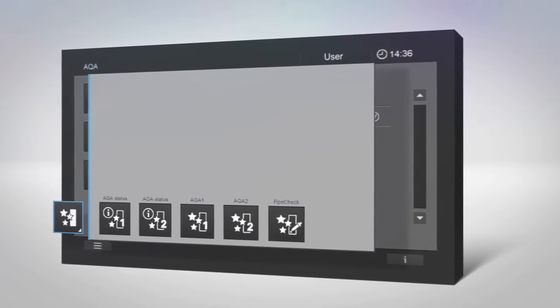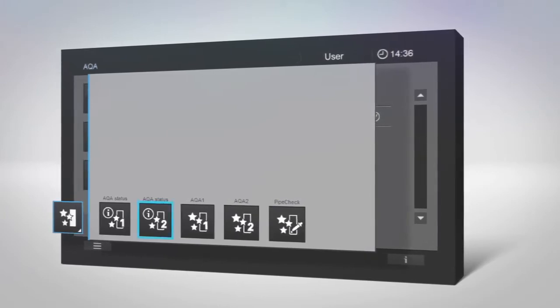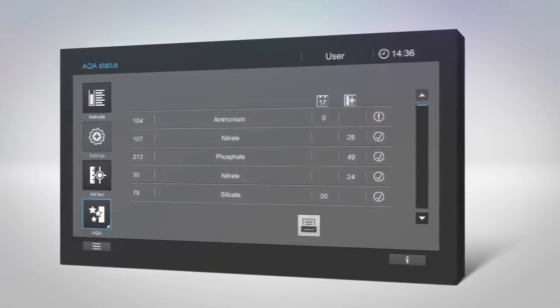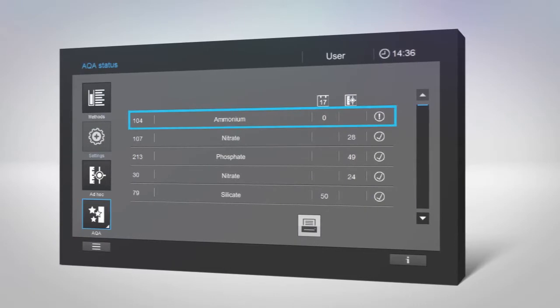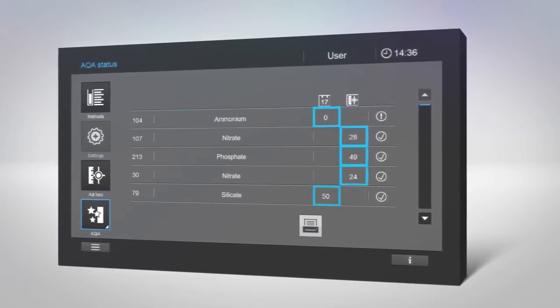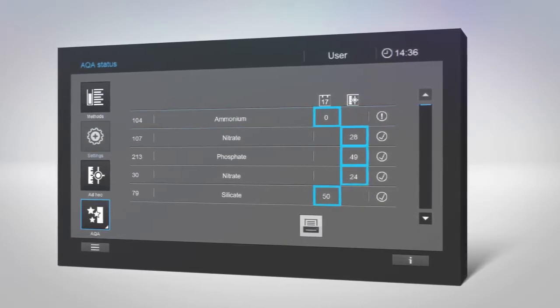To check the validity of AQAs, select Status in the AQA menu. You'll see at a glance which AQAs need to be updated and when.